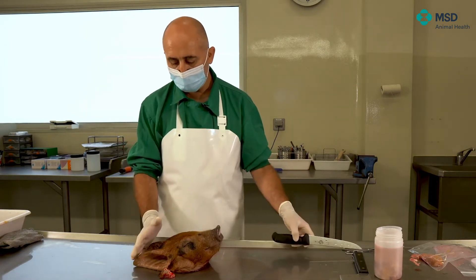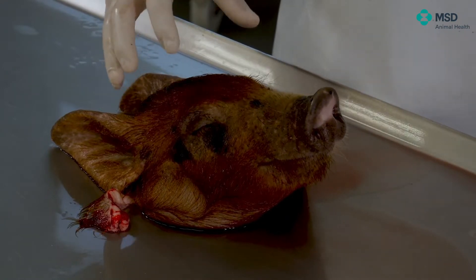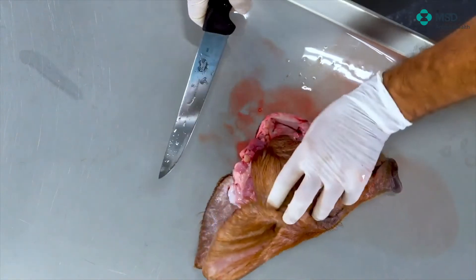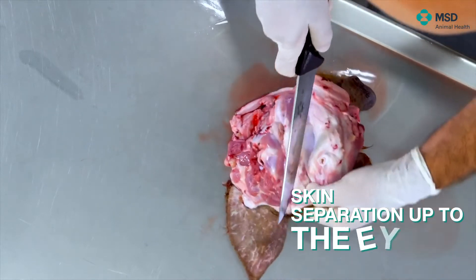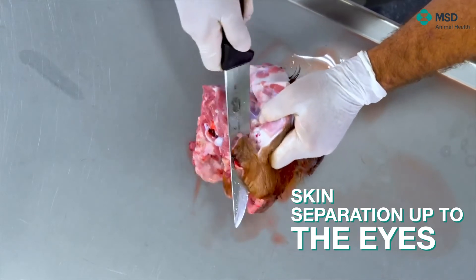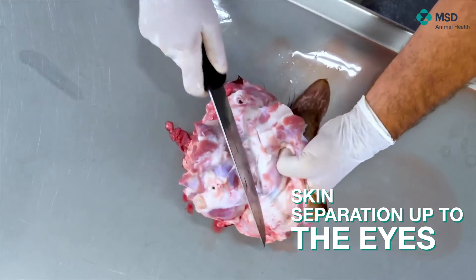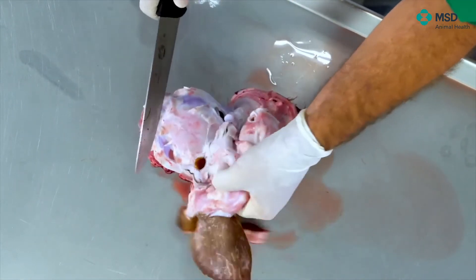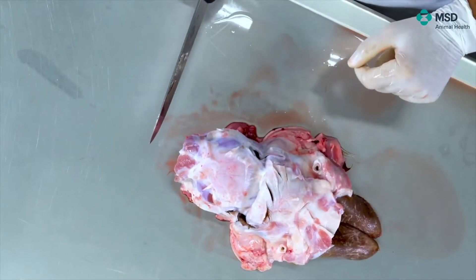The easiest way to do this is, first of all, to remove the skin from the more caudal part of the face, and then we will show which are the parts where I should cut or break the skull. I will remove the skin, going from caudal to cranial, separating the skin until I see the eyes of the animal. At this point, I reach a moment where I see the skull directly.